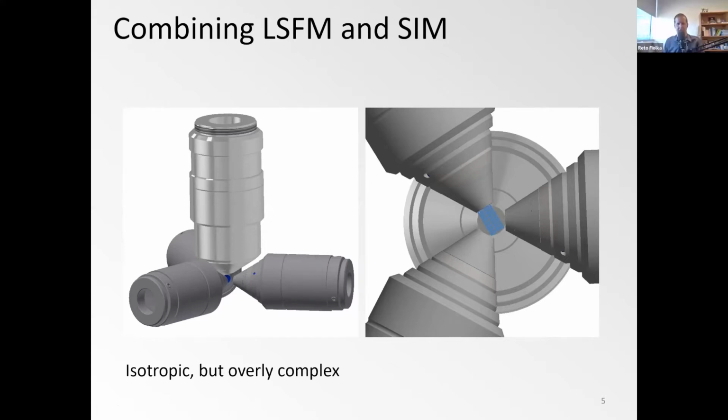So it obviously also needs very creative sample mounting. As such, I would say if you have the means of, say, a Janelia research campus, you can maybe do it. But for me, it would be quite challenging to build such a machine on a reasonable grant budget. And I would also say that sample mounting could be quite prohibitive. So let's say it's rather not practical to do it that way.